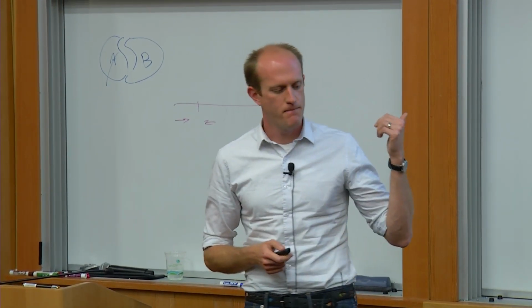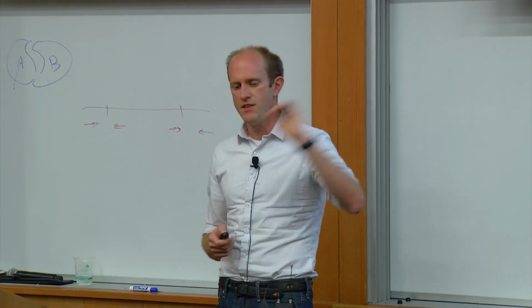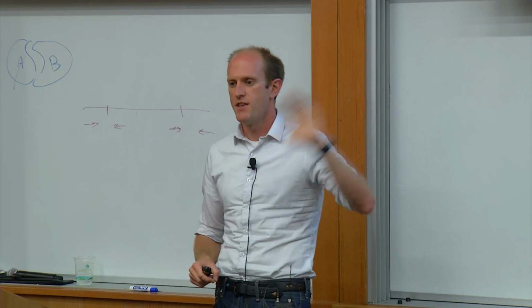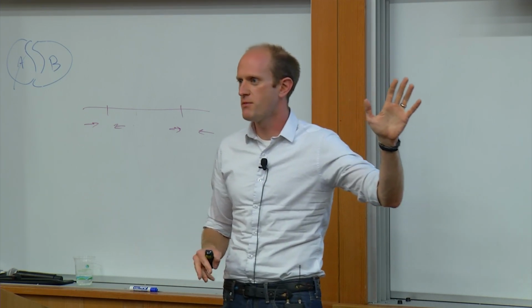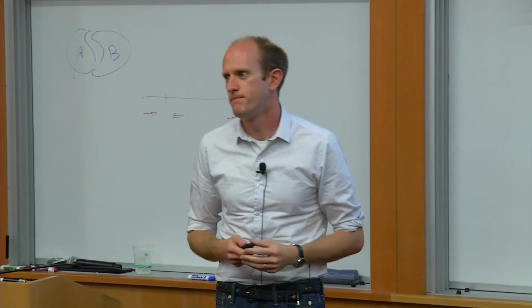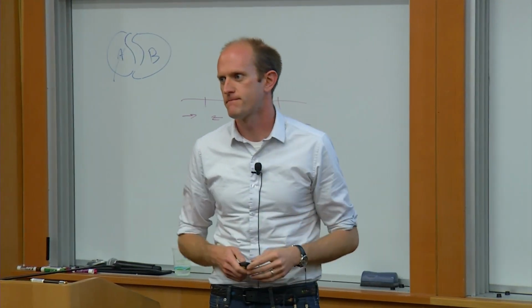And I think approaches like this are really just trying to make that very in your face, right? This one gets a score of 1,000, this one gets a score of 10. And that tells us that this one doesn't have a lot of problems. This one, I can find a lot of things wrong with. Okay? So it's really not trying to quantify so much as it's trying to stratify.